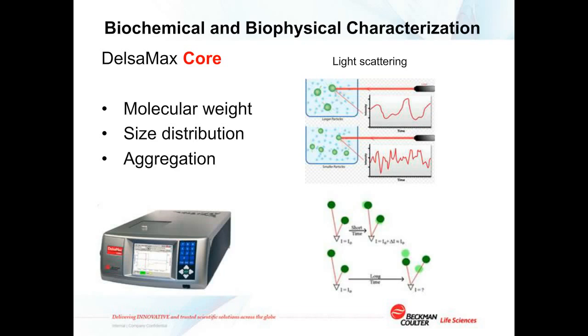And with light scattering, the correlation of scatter in time will provide an indication of the sizes of the proteins in solution. So I show at the top right an example of a large protein, or it could be other types of molecules. But the idea is, when light is scattering in time, it is quite correlated the larger the protein is, because it's moving relatively slowly. If the protein is smaller, it will actually be moving much quicker by Brownian motion, and the change in scattering patterns in time will change much quicker.